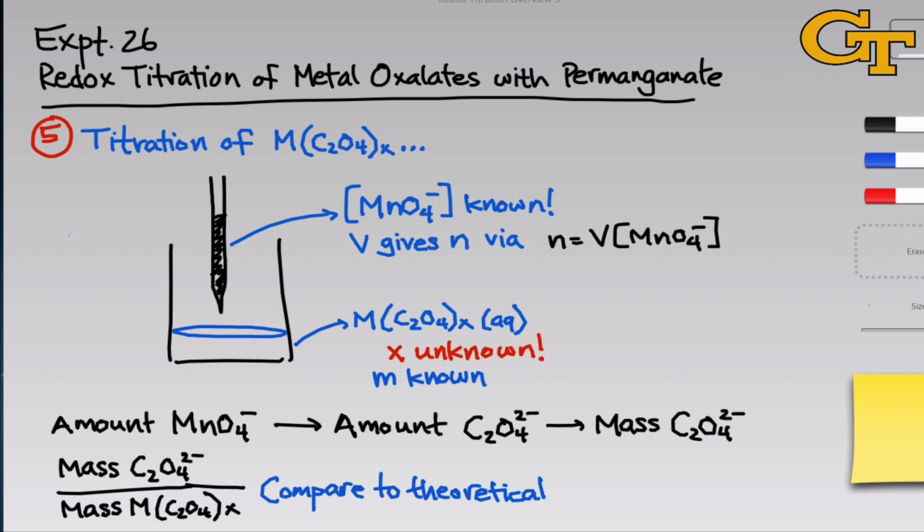The molecular formulas of the products are given there, and so you can generate a theoretical estimate for the weight percent. Compare the results of your weight percent to the theoretical given in the lab manual, and if it's close, you'll know that you've done the titration correctly.